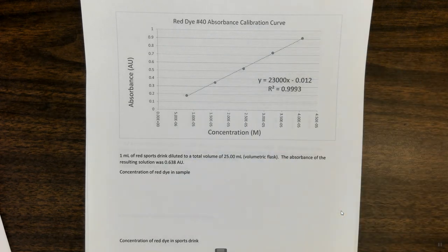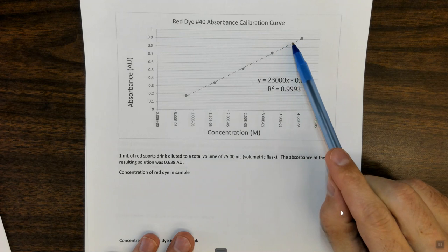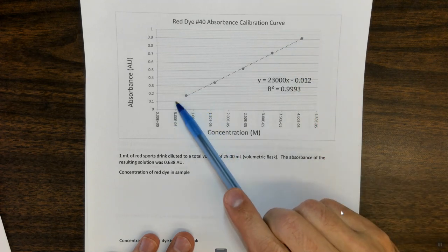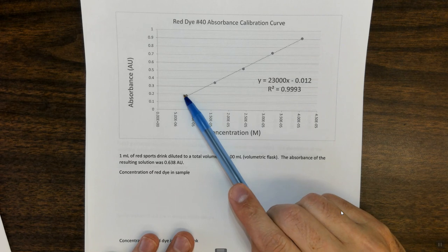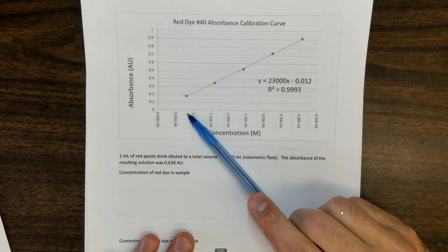So your goal here is to make a calibration curve, okay, with 5 points ranging approximately from 1 to 0.1. We're not super picky if you're a little bit lower than 0.1 or a little bit higher than 1, but 1.2 is too high, okay, and 0.08 or lower is too low, but approximately 1 to 0.1.